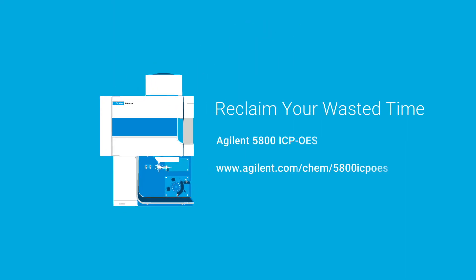Reclaim your wasted time with the Agilent 5800 ICP-OES.